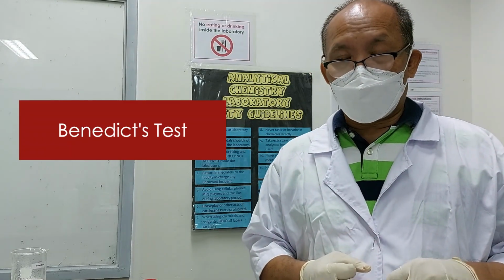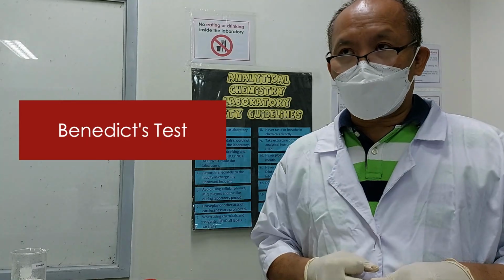Another one is Benedict's reagent. The active reagent in Benedict's reagent is cupric sulfate, and this is a basic reagent. You know cupric sulfate will precipitate as cupric hydroxide. So in order to prevent the precipitation of the reagent, it is added with what you call a chelating agent. A chelating agent is a compound that will prevent the copper ion from precipitating so that it will react with your organic compound.